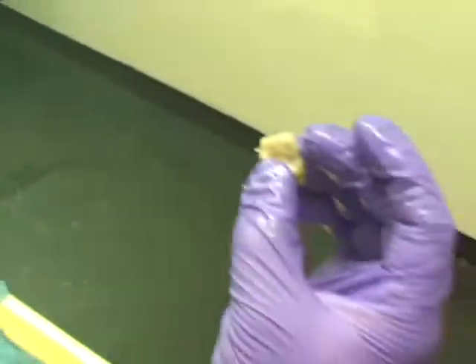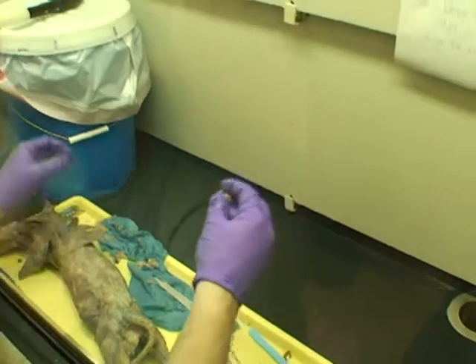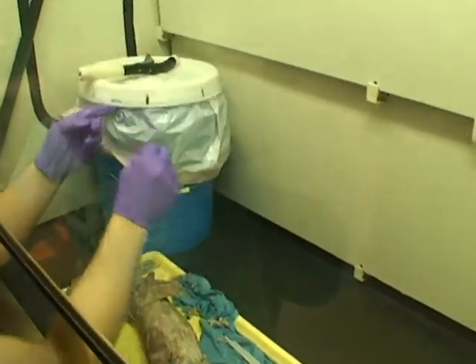It also doesn't have a straight change of actual muscle. That's removing anal glands 101.